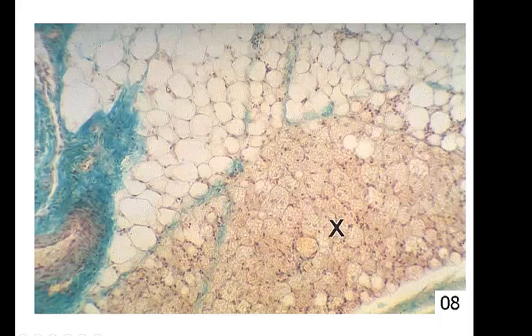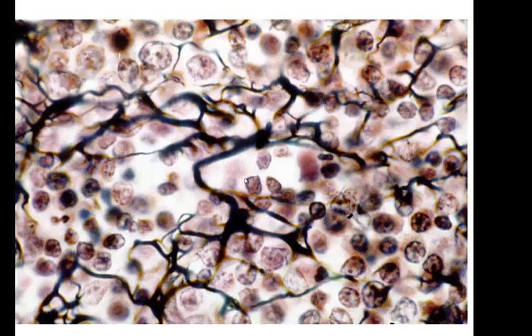All of this up here, this is all fat. Don't worry about this down here, but that's fat. This is reticular tissue. This is our last loose connective tissue picture. These are all the reticular fibers here, and there are no other fiber types in the reticular tissue. Notice how they're very large, the reticular fibers in some areas, and then they get smaller.